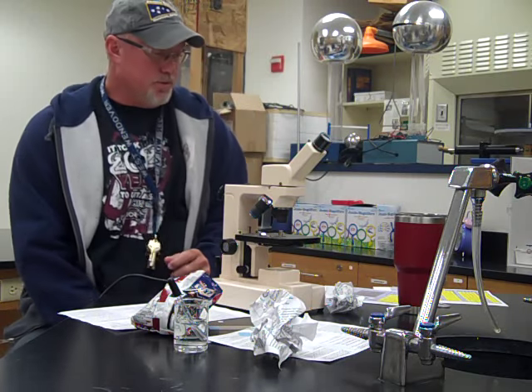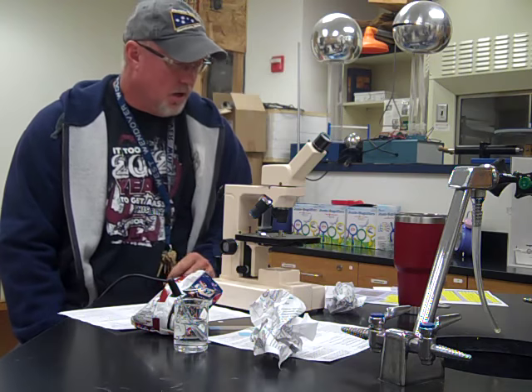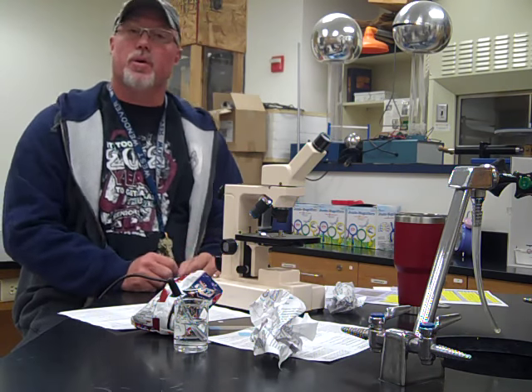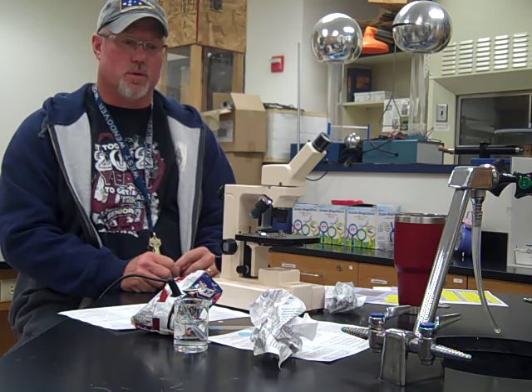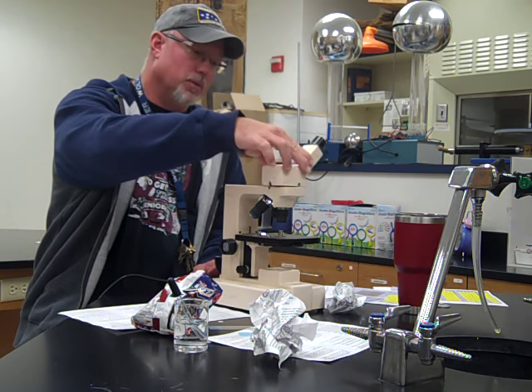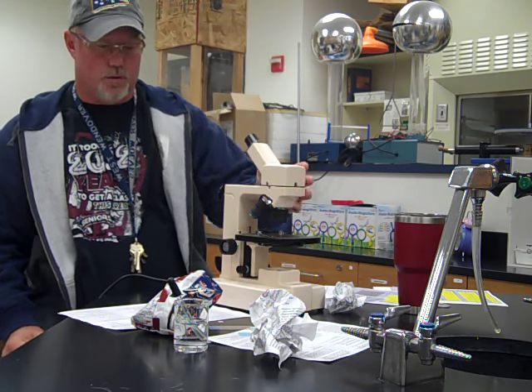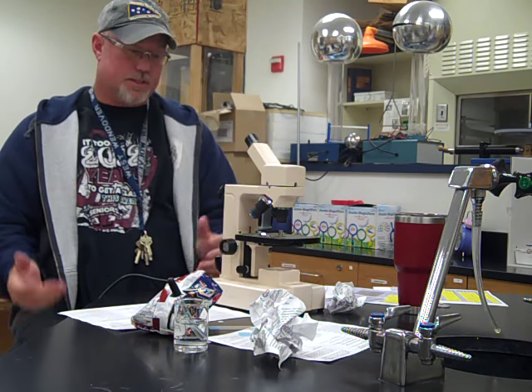This is a video for you guys to watch. You're also going to be completing the proper care and handling of a microscope document that will be in Google Classroom. There are 4 microscopes that you will be going through, even though I'm not in the room for you. So let's get started.